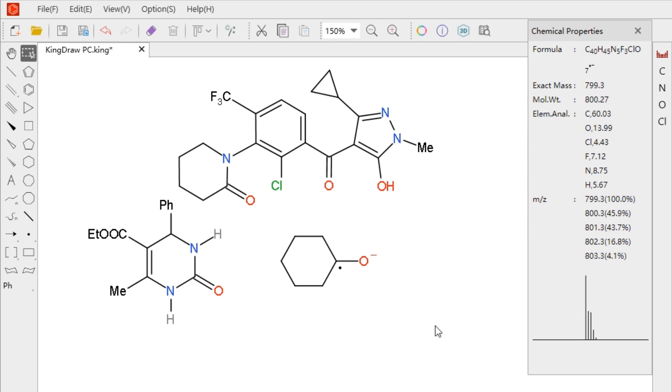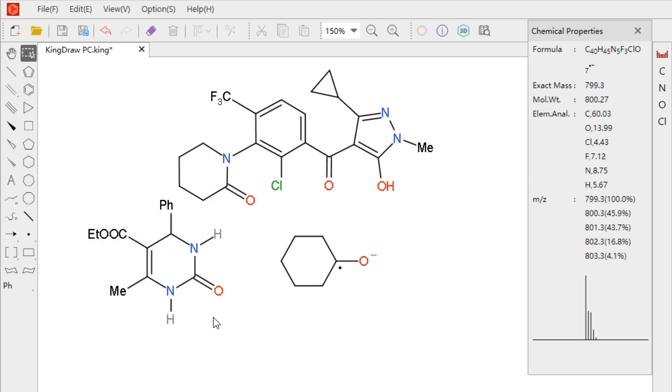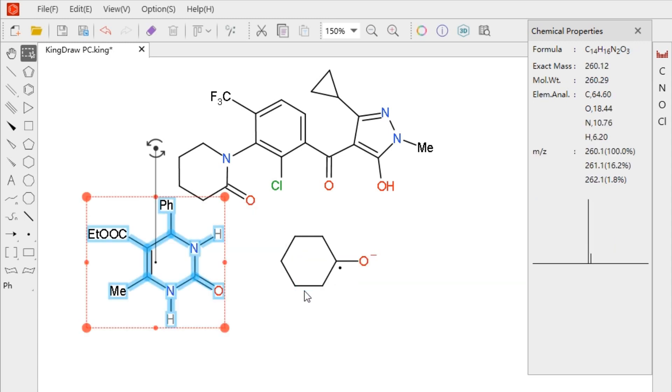Here is a method to quickly select a single structure. When it is not convenient for selection, we can right-click the bond or elements in the structure and choose Select Molecule option in the right-click menu. We can quickly select the current molecule.